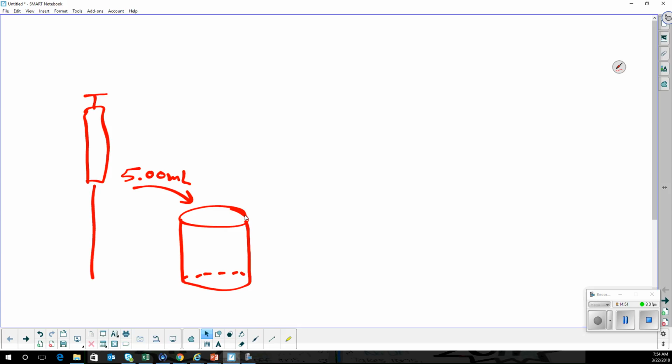And you're going to put it in your burette, just like we've done before. If it's acid, you're putting acid in there. If you're base, you're putting base in. Now, if you are acid, this is important. Do not put it in a burette that has the blue tape around the top of it. Put it in one that doesn't have that. Because if you put it in one that does have the blue tape around it, you're going to get salt down into that little hole and it's going to clog. Okay? Does that make sense?